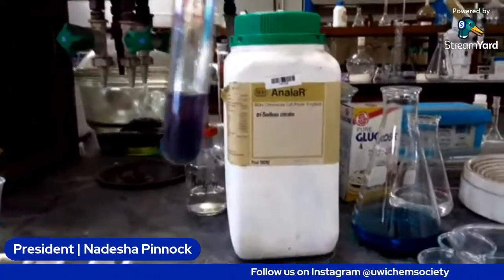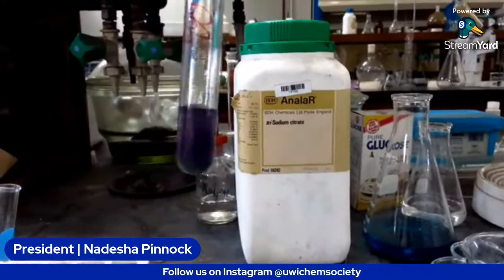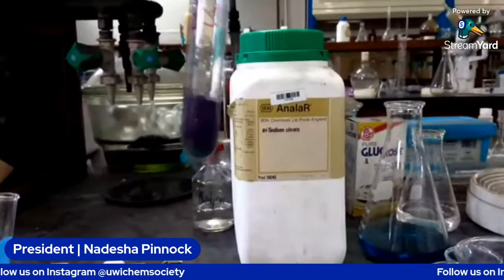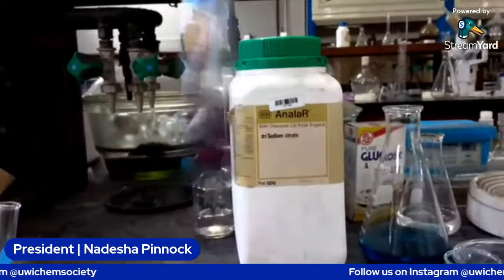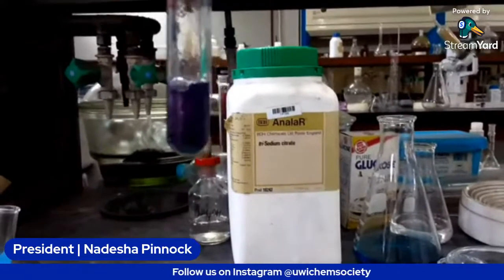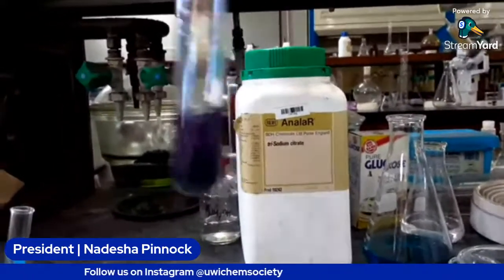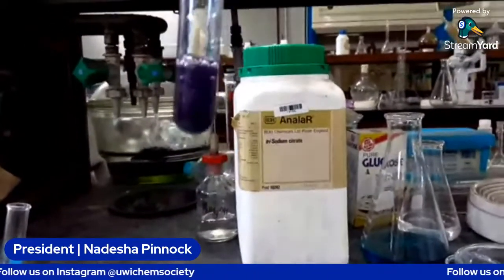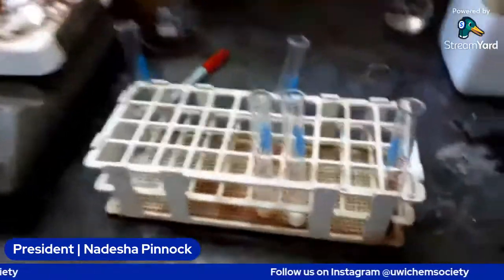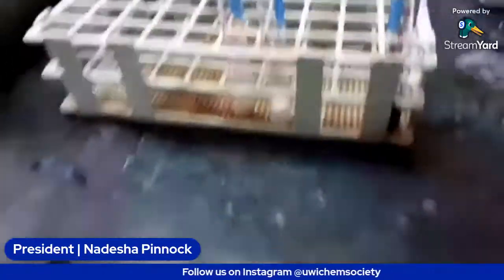Camera focus. There we go. So as time goes on and you allow it to sit some more, it gets darker and darker. So you see a dark purple color. I assume that everybody is seeing that. Yeah, so we're going to allow that to sit and we're going to do our milk.